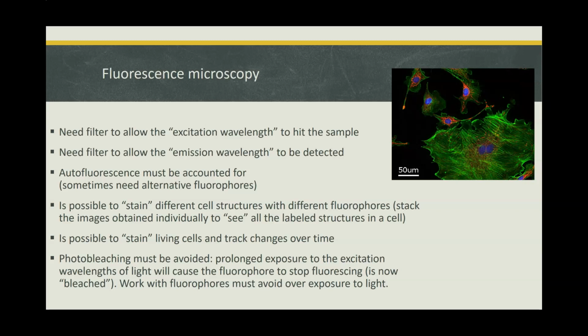Another problem is photobleaching. This is a phenomenon where prolonged excitation of the fluorophore with light causes it to stop fluorescing altogether. This results in fading of your sample over time. Thus, when working with fluorophores, you must protect them from light until you're ready to image them, or you risk losing sensitivity, or worse, risk losing all of the signal from your sample.